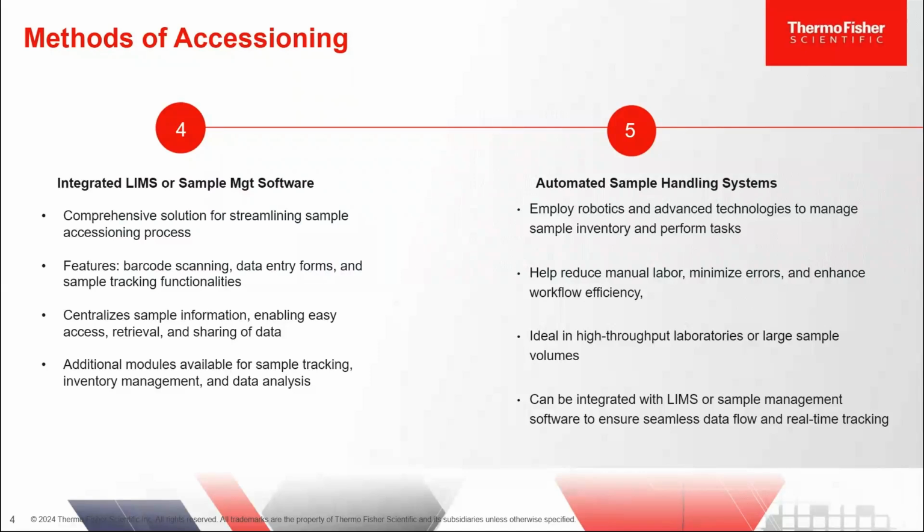They reduce a lot of the manual labor, minimize error, and enhance workflow efficiency. As I mentioned, very useful for high throughput laboratories and those dealing with large sample volumes. And these systems, of course, can be integrated with the LIMS or sample management software to ensure seamless data flow and real-time sample tracking as well.